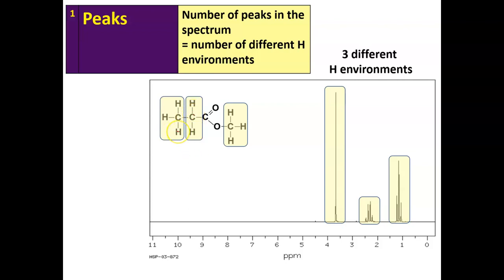This particular type of hydrogen is extremely common. As you can imagine, in most organic compounds, these are hydrogens bonding to carbon, and as you can see, a CH3 group is often the end of a molecule. Obviously, we can also see that the middle of the 3 peaks on the structure, this CH2 group, this methylene group, is a different environment because the H's on this carbon are bonded on this side to a carbonyl oxygen-carbon group, which of course is different.